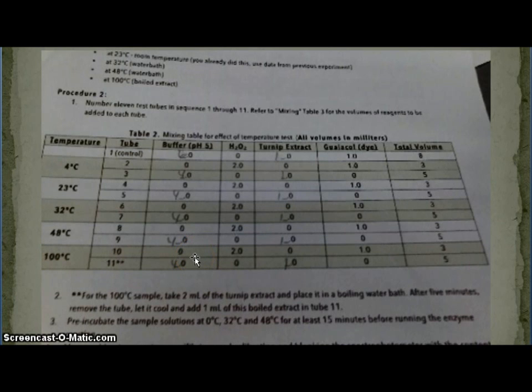For part 2, we set up our new clean 11 tubes as it's shown in this table. Once placed in the required temperature as listed, we then took more readings using the spectrometer every 20 seconds for 2 minutes.